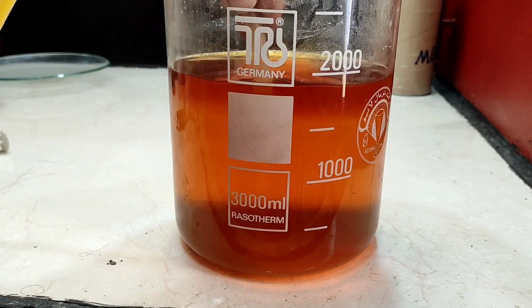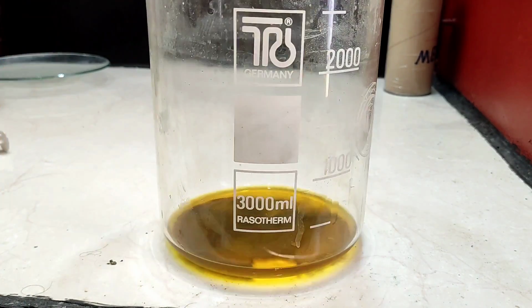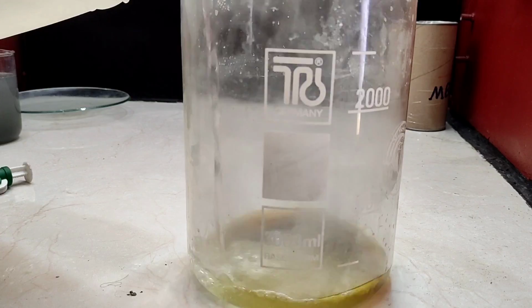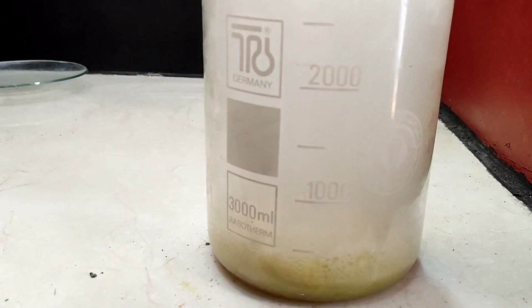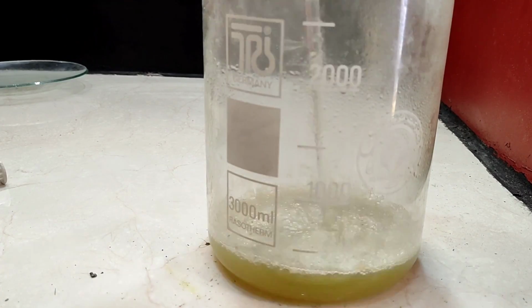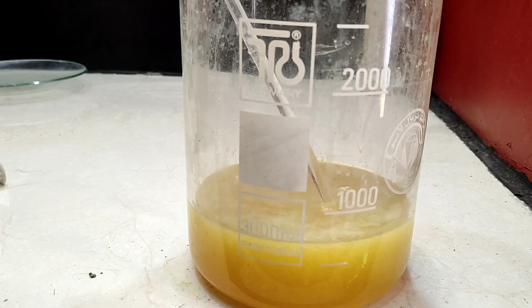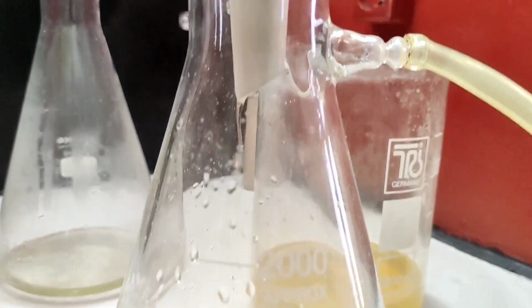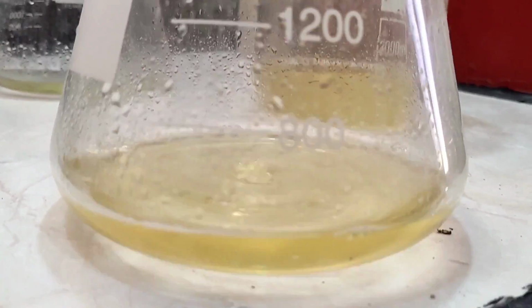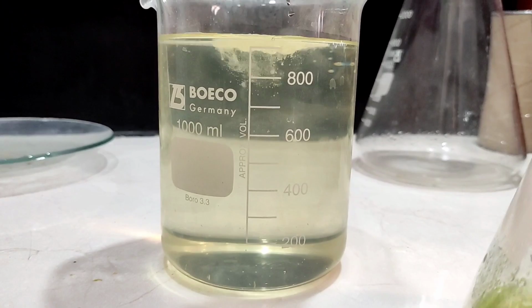Next day I checked the cyanide waste. There was some black precipitate at the bottom, which could potentially be gold and zinc. I found it a good idea to treat it with hydrochloric acid this time instead of nitric acid. After decanting, the black residue was treated with hydrochloric acid and the remaining powder redissolved with some drops of bleach and then filtered. This batch was much easier to recover than the nitric acid batch.